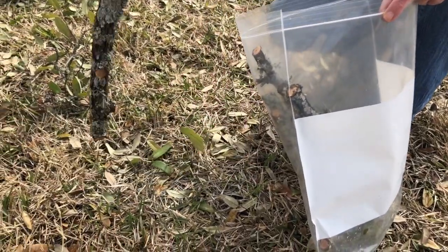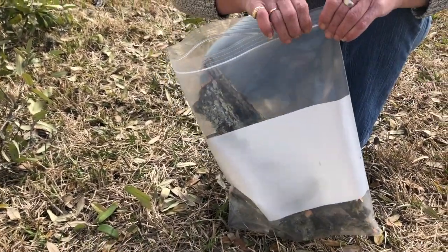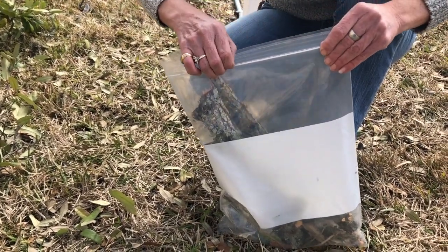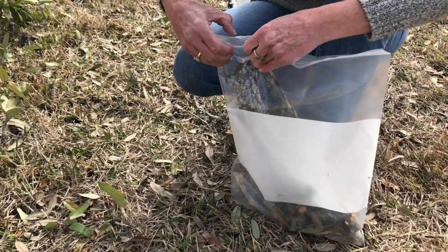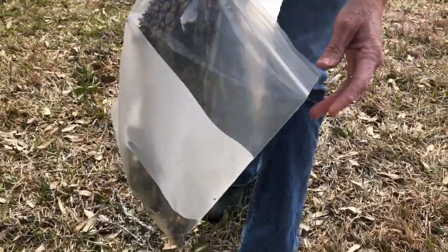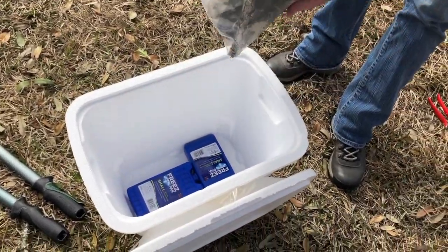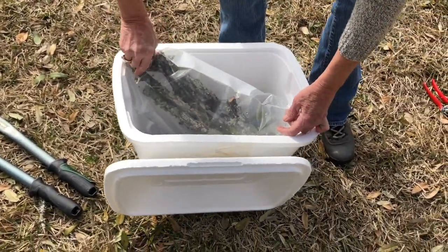Once you have the sample ready to go, you're going to have to package it so that it gets into the clinic in condition that we can grow the fungus out. We're going to put it in a plastic bag like this, and it always helps to throw in a few of the symptomatic leaves — the thing that made you suspect you might have oak wilt. Try to squeeze the air out of the bag and seal it very well. We assume that you are going to pack it in an ice chest with blue ice. It's very dangerous to use real ice because real ice is going to melt during transit, and we want to be sure that the sample doesn't get wet.